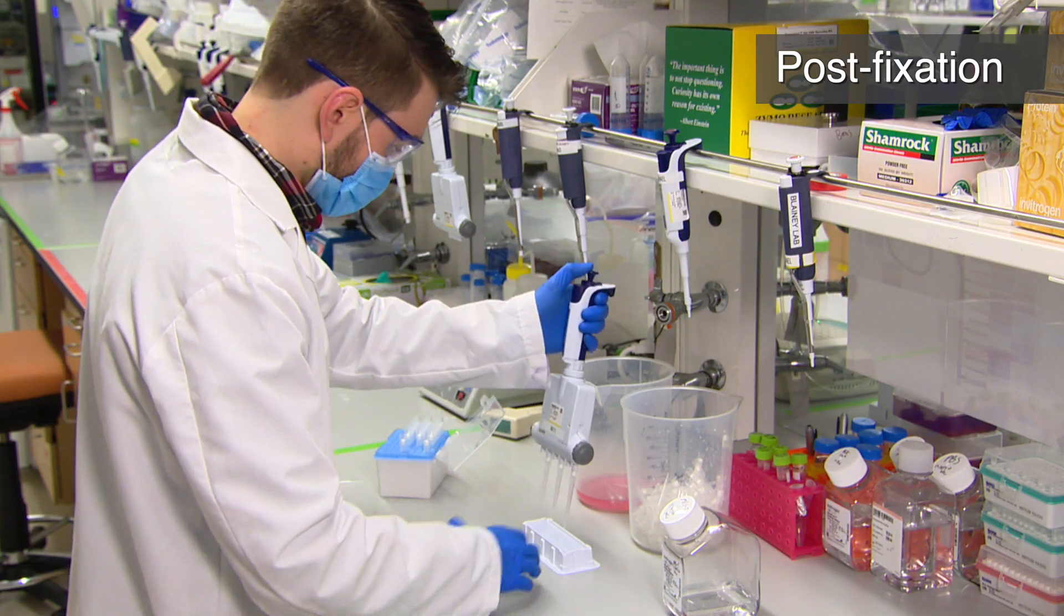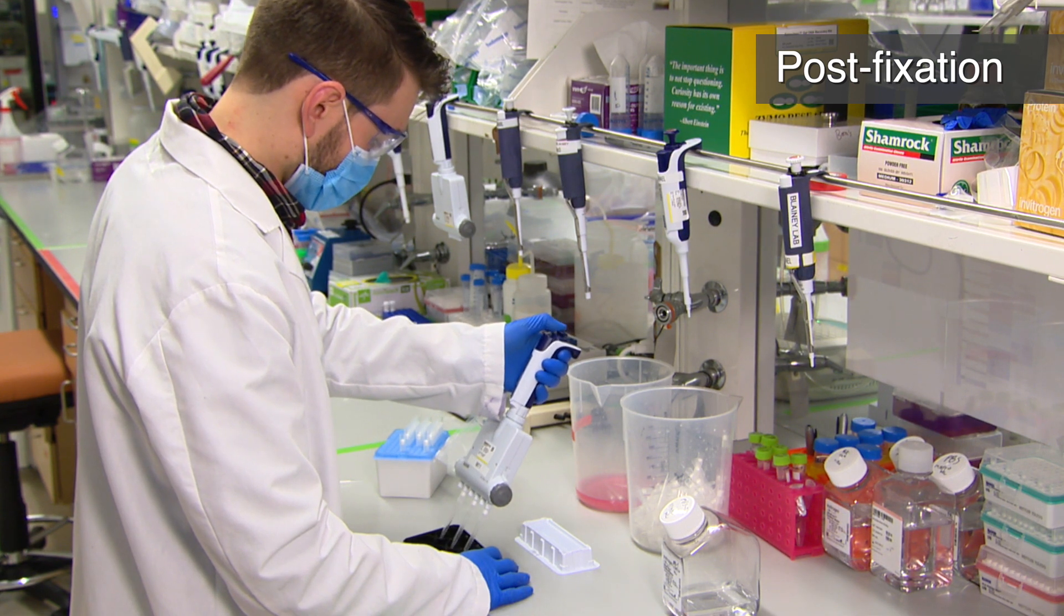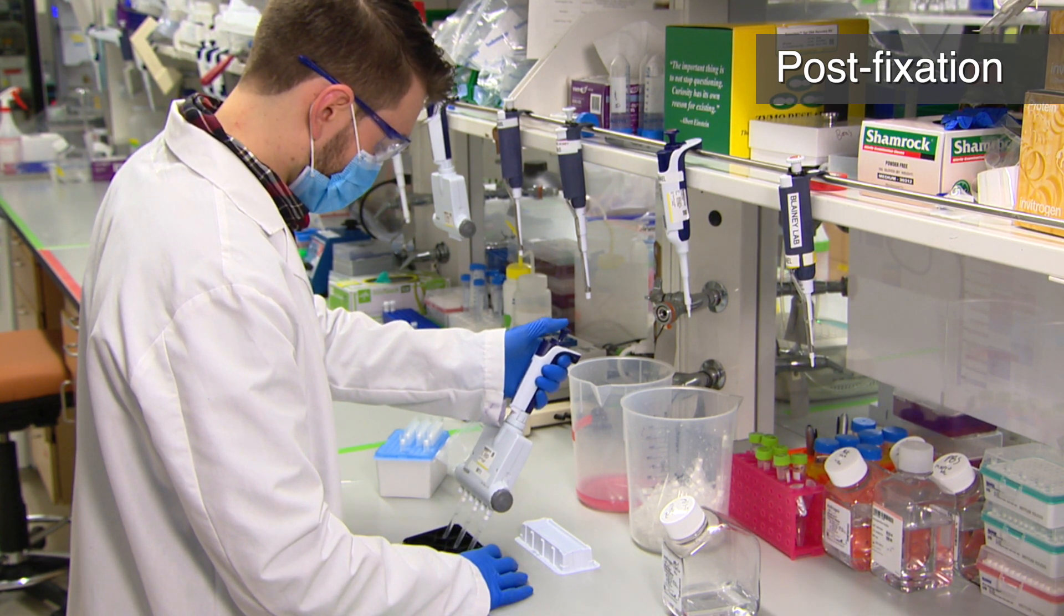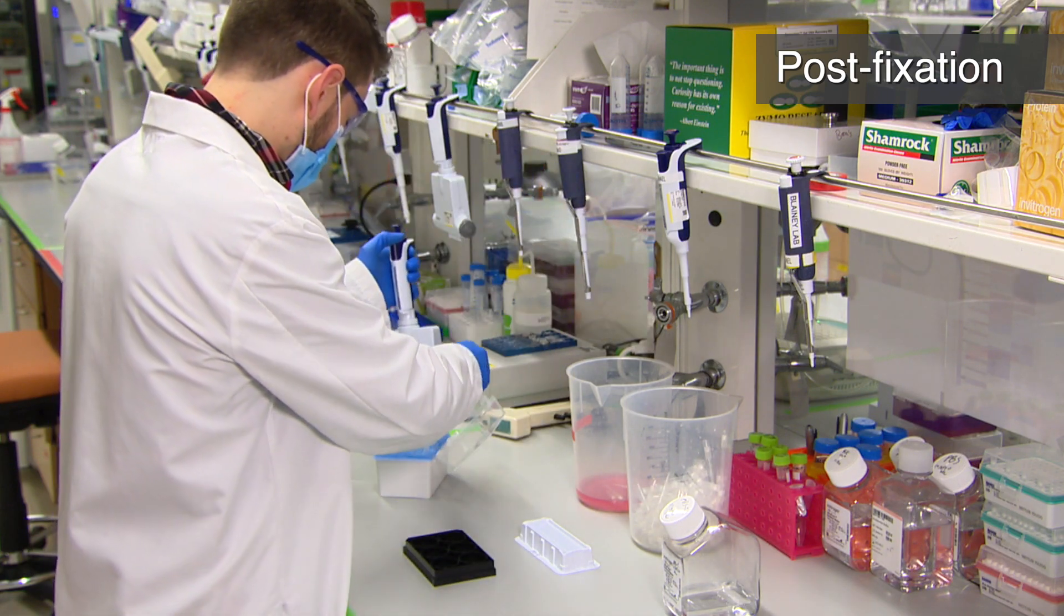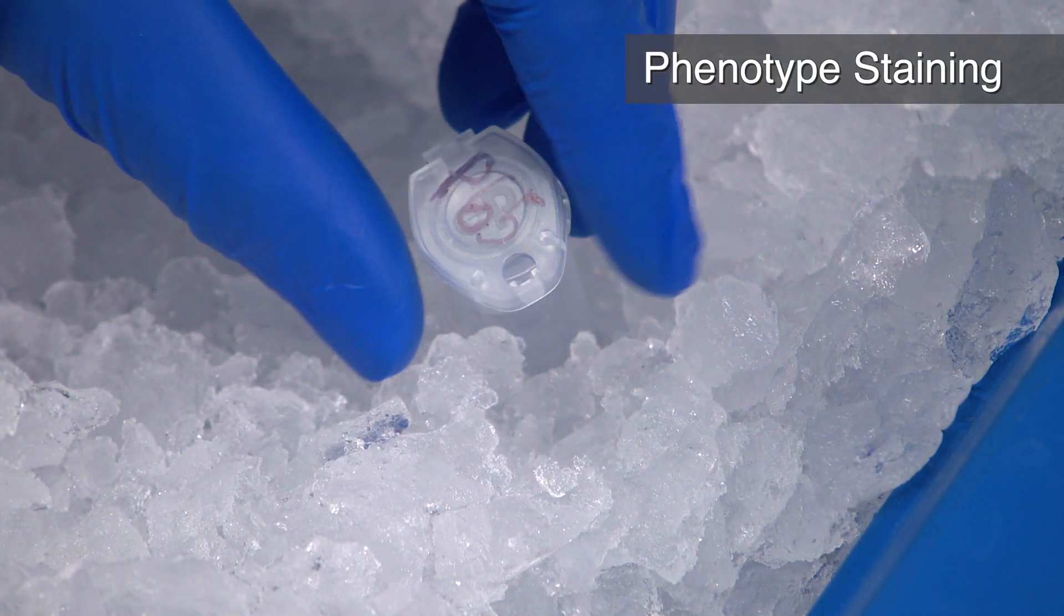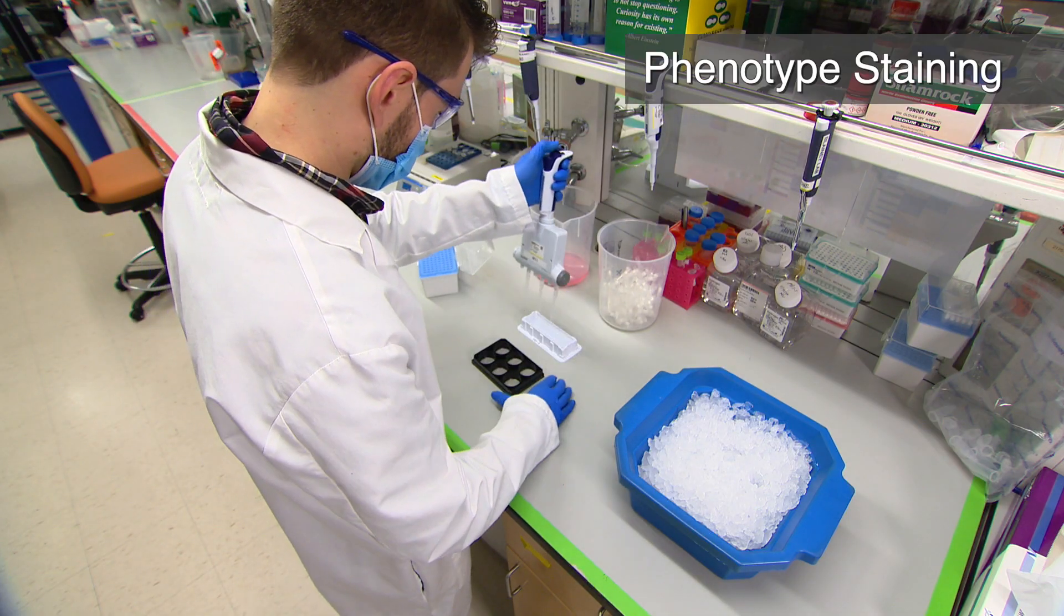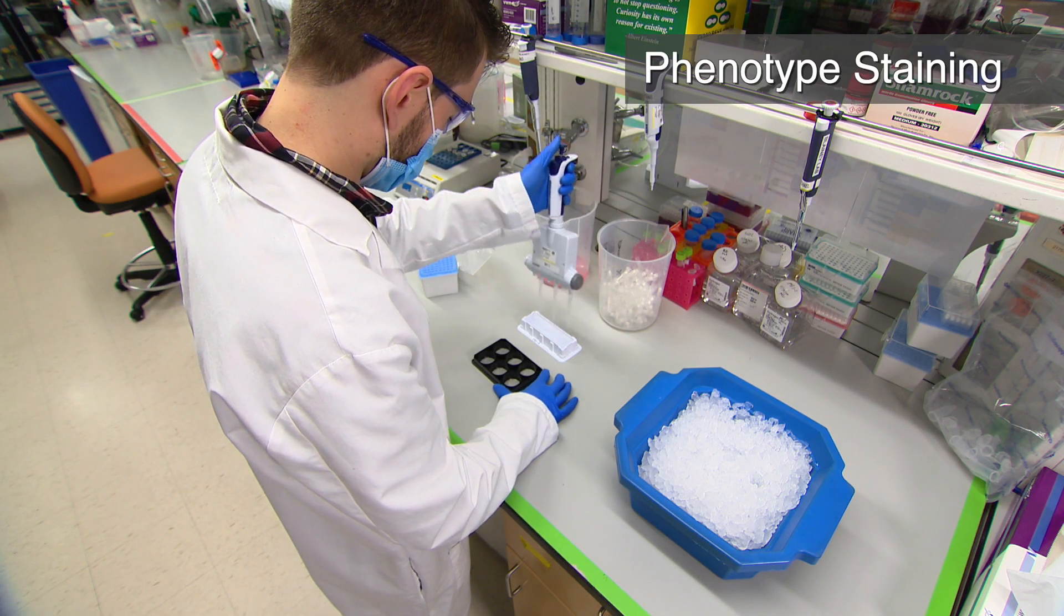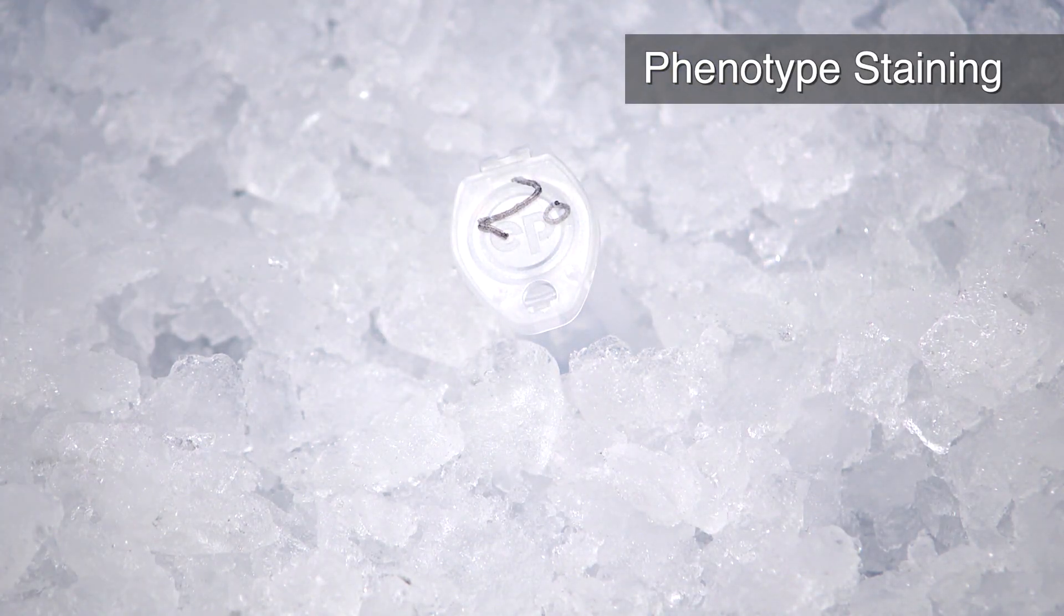The next day, wash 6 times with PBS-T and fix with 3% paraformaldehyde and 0.1% glutaraldehyde in PBS for 30 minutes at room temperature. Wash 3 times with PBS-T and stain with P65 primary antibody for 1 hour at room temperature. Then, wash 3 times with PBS-T and incubate with secondary antibody for 45 minutes at room temperature.